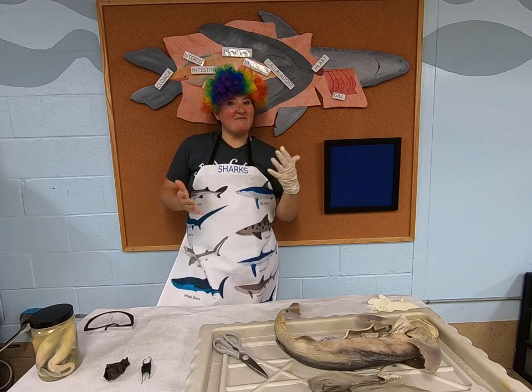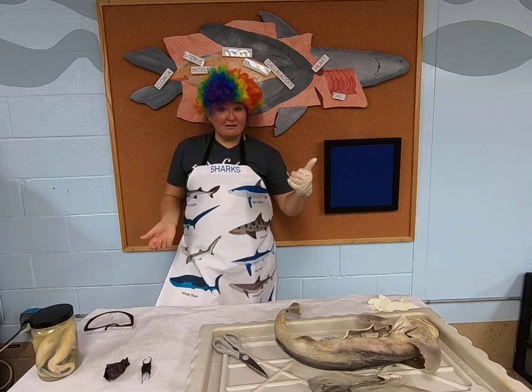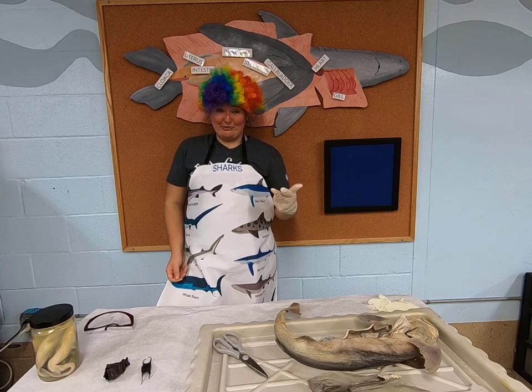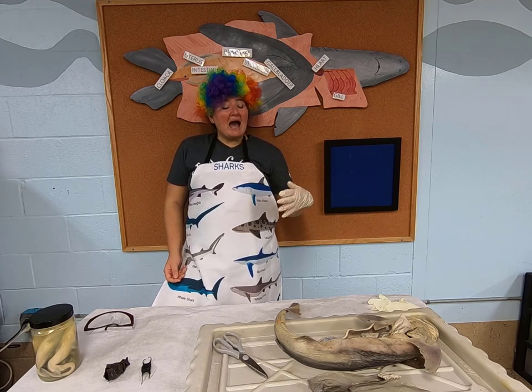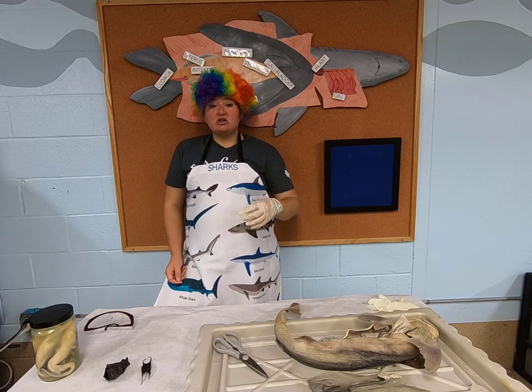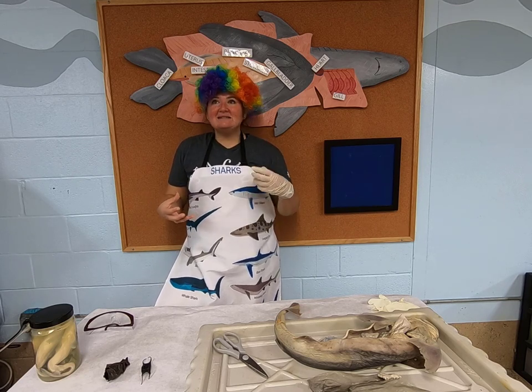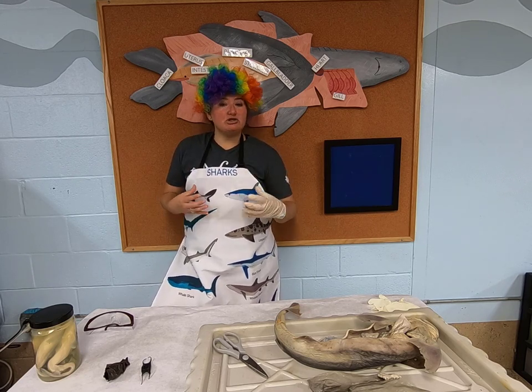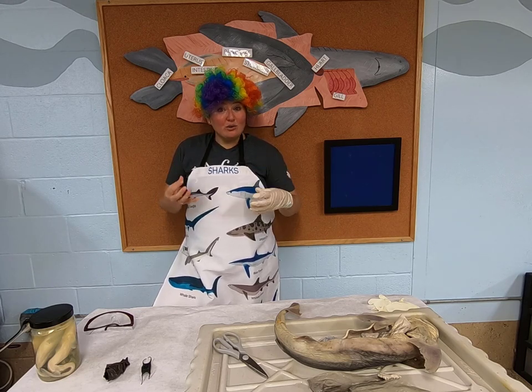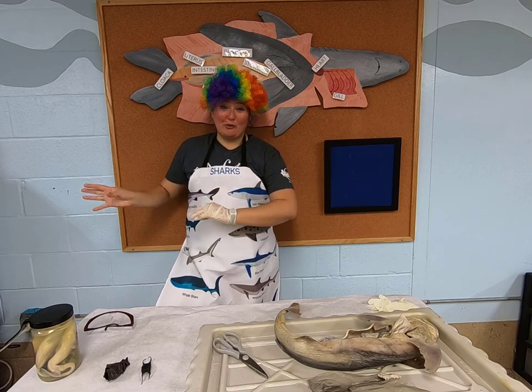Then we have this crazy thing called ovoviviparity. So we have oviparity, egg laying, viviparity, live birth, and ovoviviparity, which is a combination of the two. What the mom does is it has an egg sac in its uterus, and the baby starts to survive off of this egg sac, this yolk sac. And so they start to grow up, they're getting nutrients, they're still protected by mom. Whenever they run out of that yolk sac, then they're birthed live and go off into the world.